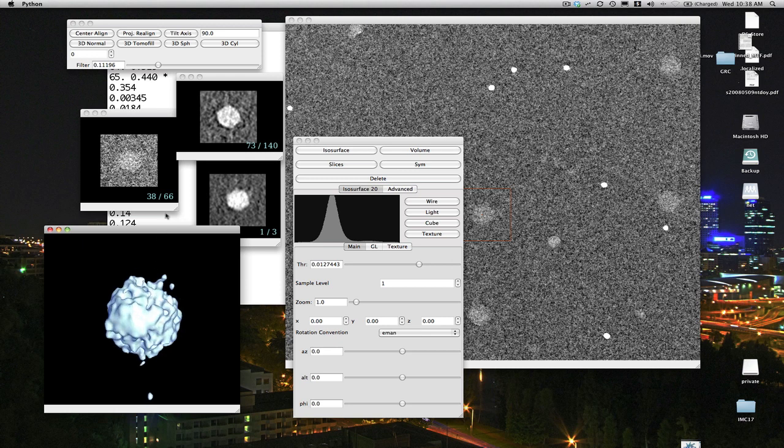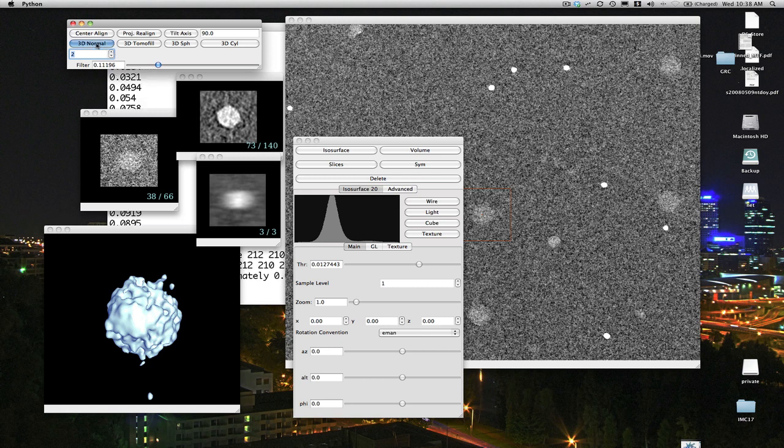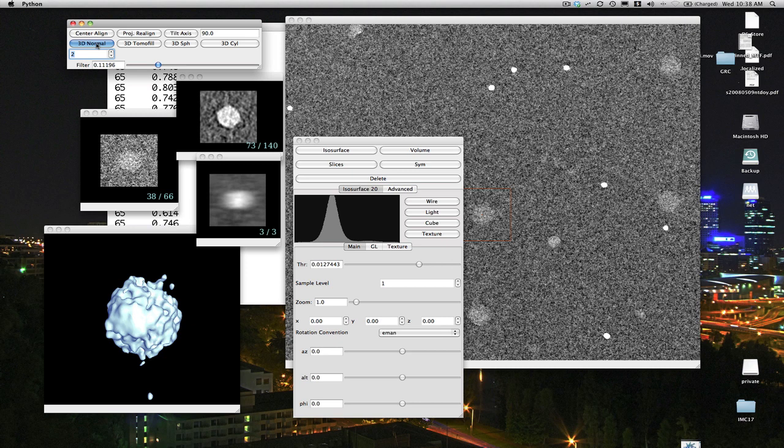Now, there are a couple of other options as well. Since the missing wedge is such a problem, there are variants of the 3D reconstruction strategy that we can use. They're a little bit slower, but they can sometimes produce better results. So what I'm going to do is I'm going to change this from 0 to 2, for example, and then press 3D normal again. And this is going to do a new 3D reconstruction, take a little bit more time, using a wider interpolation radius in Fourier space. And when it's done, it'll be filtered again, and everything should be nice.